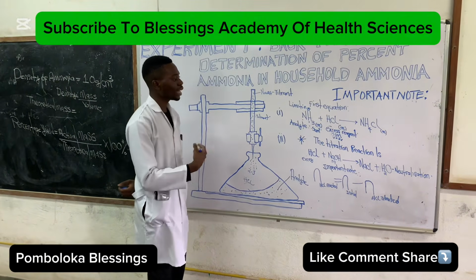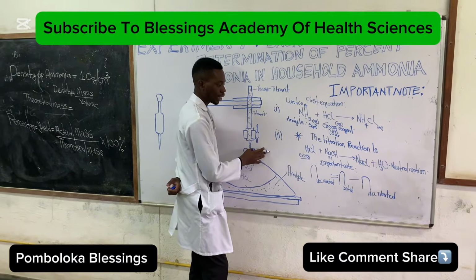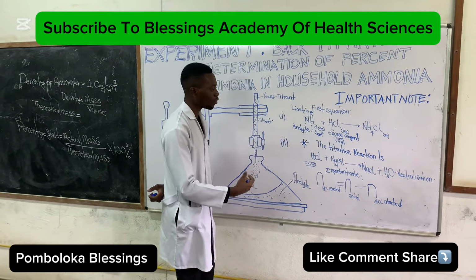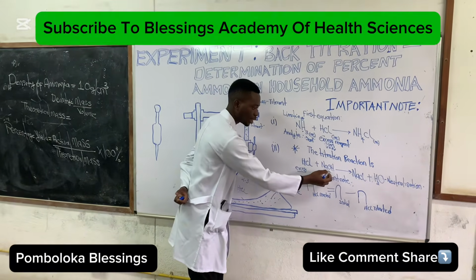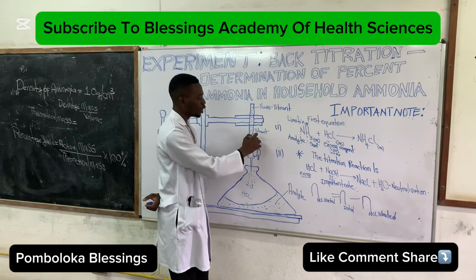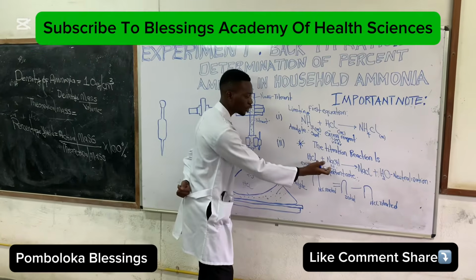What we're simply doing here is trying to find out the moles of the hydrochloric acid, because we don't know the moles here. And because the ammonia was limiting, we expect the HCl to be in excess. So in the second part of the reaction, where we have titration, we have the concentration of the sodium hydroxide, which is 0.1, with a certain volume, which we're going to find out because we're supposed to titrate this. We're going to find the mean titer volume of the sodium hydroxide, which is going to be our overall volume here.